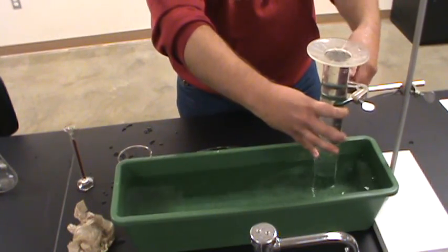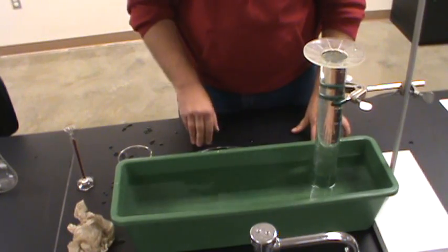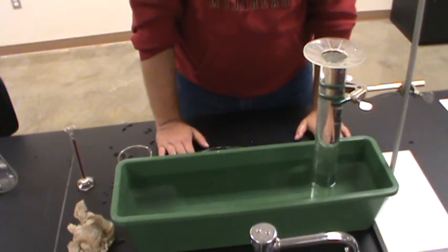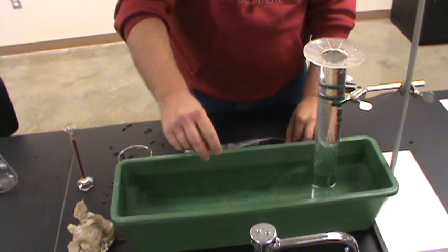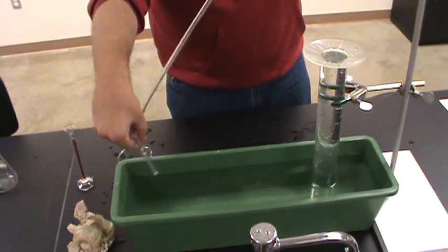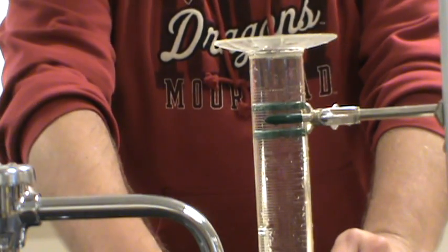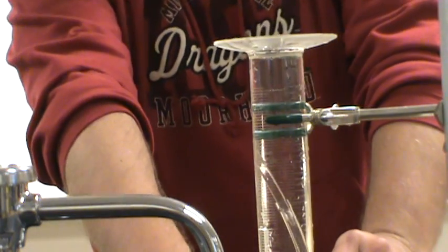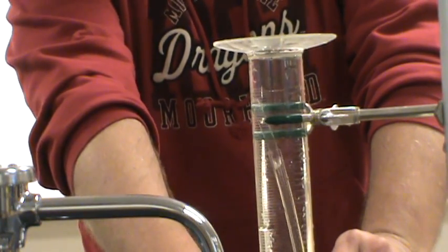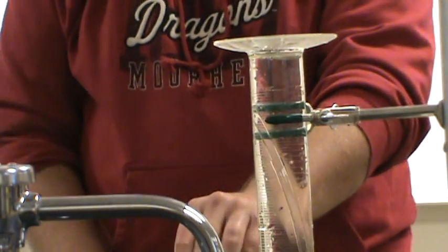Now if I take my hand and carefully seal the top, I should be able to pick it up, tip it, and once it's under the surface of the water in the trough it should be fine. I'll go ahead and put this in the clamp just to keep it from tipping over. Now I can slide the gas collection tube up until it's well up into the cylinder — you can just see it there — and now I'm ready for data collection.